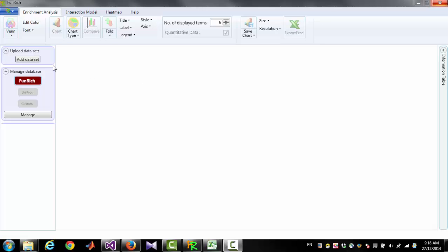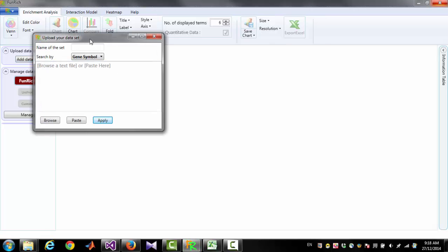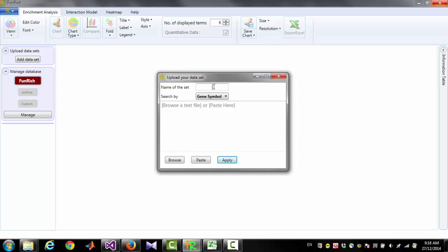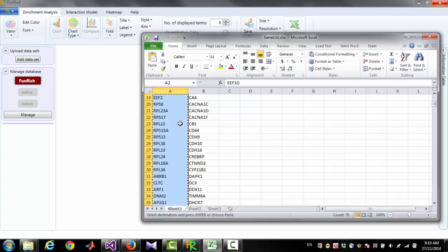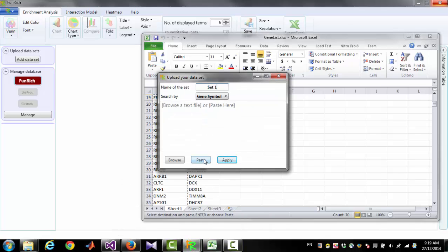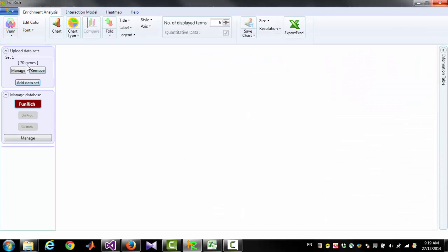To import a list of genes in Furnridge, you have to click the button 'Add Data Set'. Then you must give a name for the data set — for example, Set 1. To import the list of genes, you can go to Excel, select all the cells you want to import, copy them, then click Paste and then Apply. This will import the 70 genes you have selected.